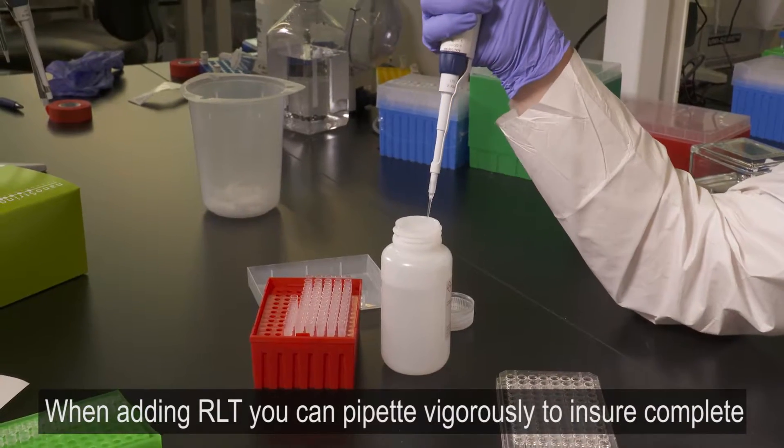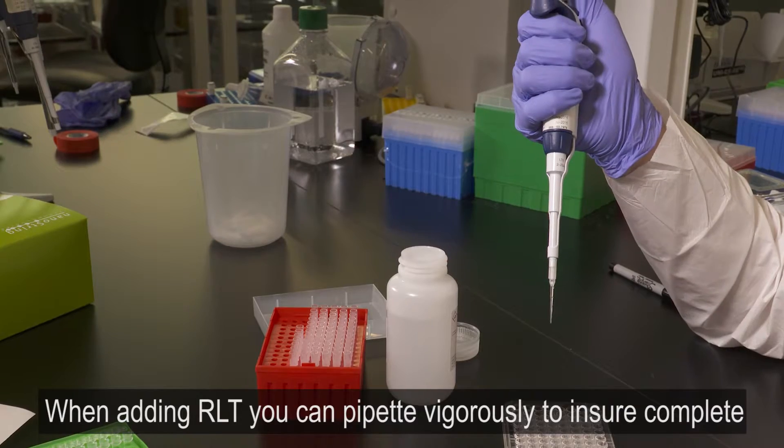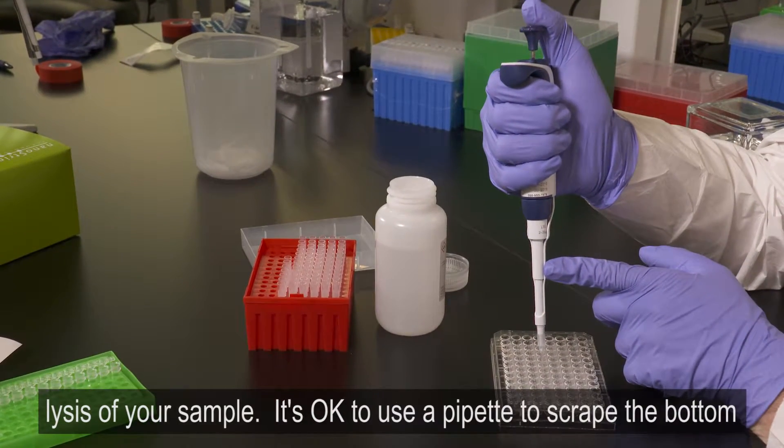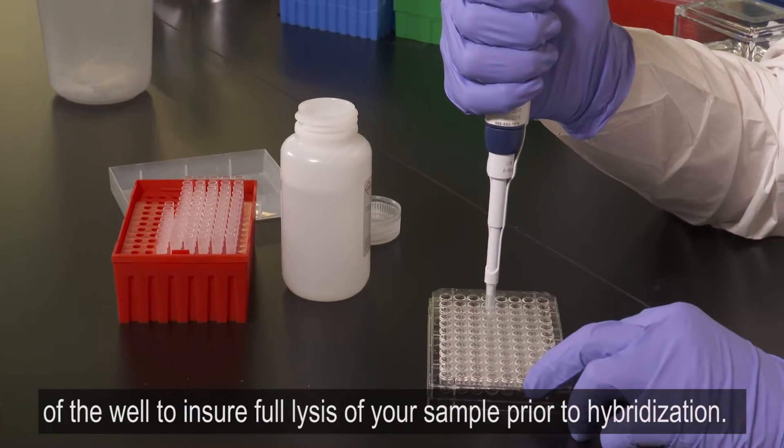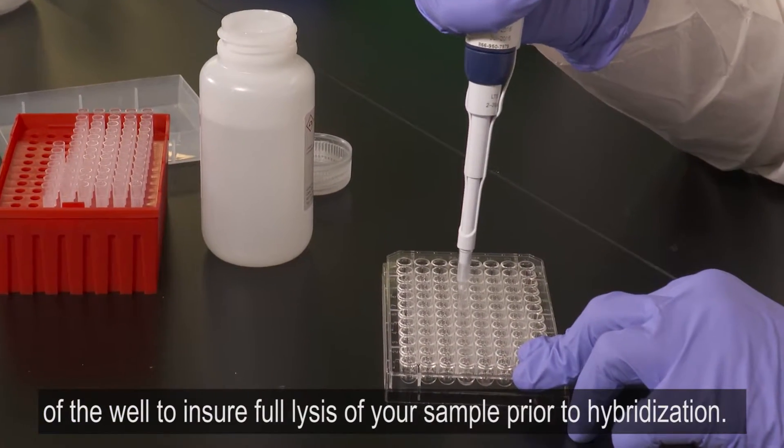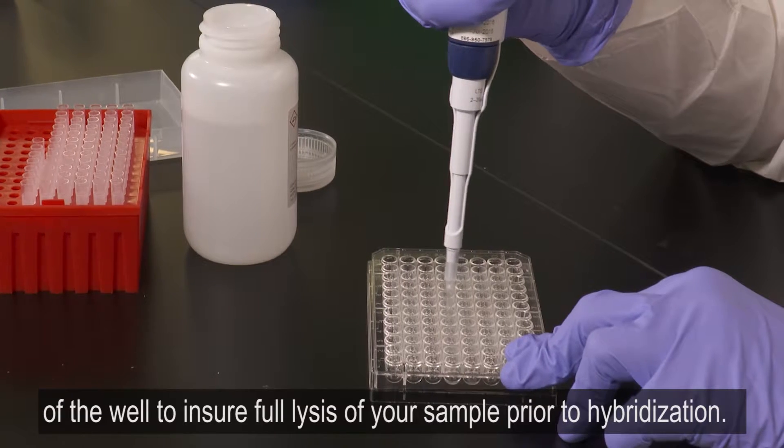When adding RLT, you can pipette vigorously to ensure complete lysis of your sample. It's okay to use the pipette tip to scrape the bottom of the wells to ensure full lysis of your sample prior to hybridization.